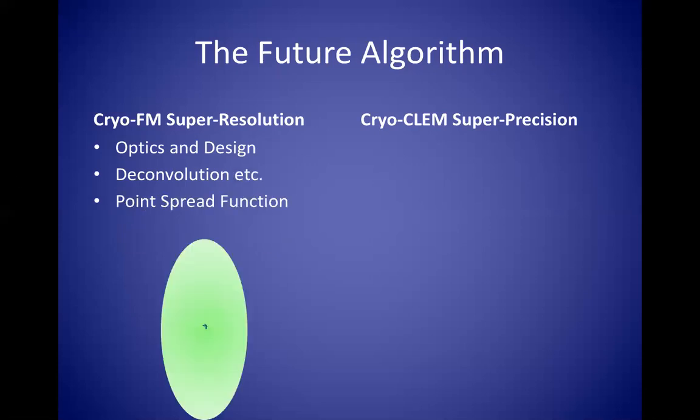And finally, we have to deal with the point spread function. So a fluorophore is typically modeled as a 3-dimensional Gaussian of photons. Photons are single particles of light. And then when you image it with your instrument, it becomes typically sort of this elongated form where you have a radial dimension that is more narrow than your axial dimension. And because we know what this form looks like, this point spread function, we can use that for modeling. And so super resolution techniques will actually predict, okay, I have this point spread function, where is my fluorophore within that?